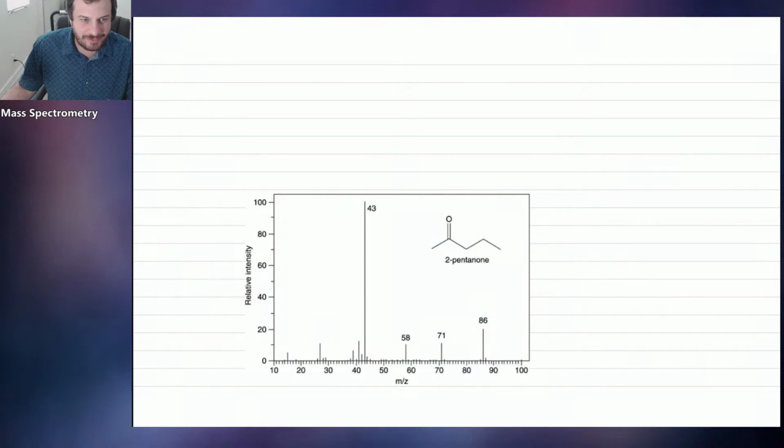In this lesson, we're going to look at a fascinating and exciting technique in organic chemistry called mass spectrometry. Mass spectrometry is a way to weigh individual molecules, and it's really quite an amazing technique.